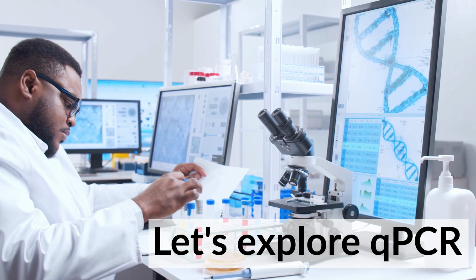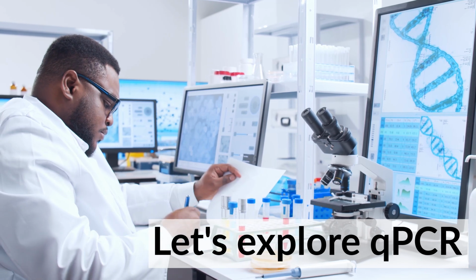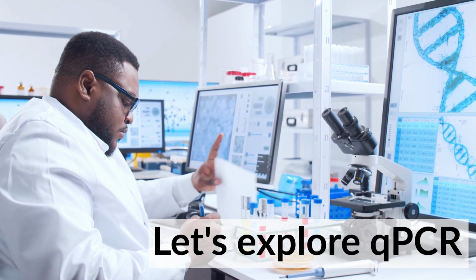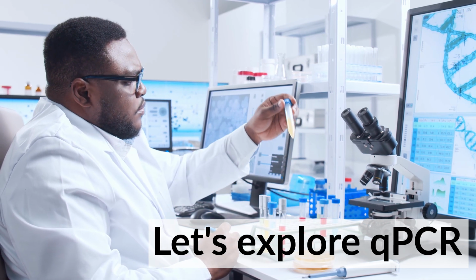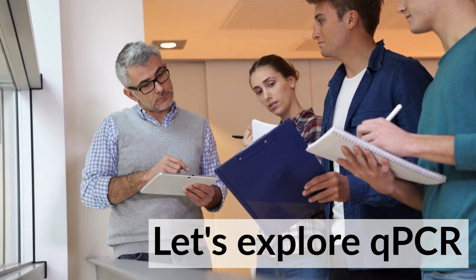In this video, we're going to explore the fascinating world of molecular biology and explore a powerful technique called qPCR, which is short for Quantitative Polymerase Chain Reaction. Don't worry, we'll break it down step by step.